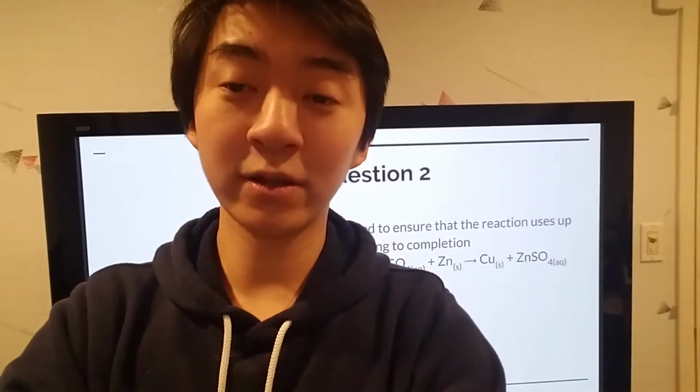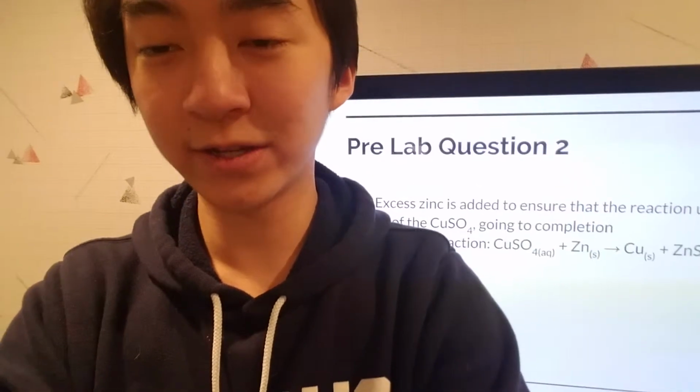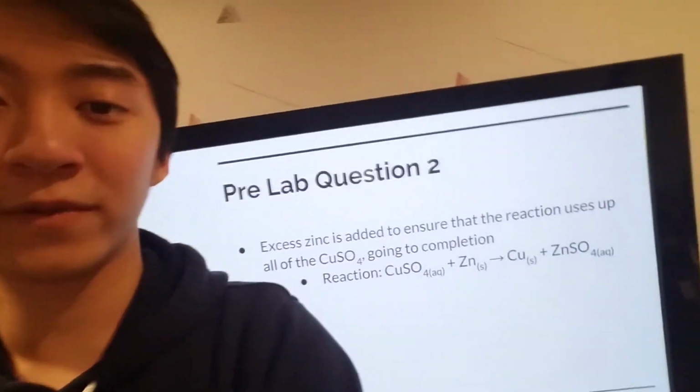In the final reaction of this experiment, we use a large excess of zinc in order to ensure that all of the CuSO4 is reacted to allow the reaction to go to completion, therefore allowing all of the Cu as a solid to be recovered.